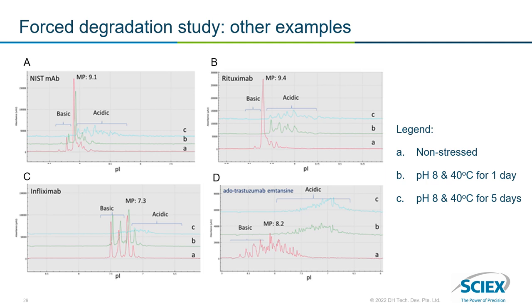These data demonstrate how this method can be applied as a platform method for a wide variety of therapeutic protein species and can help you make informed decisions about your product during developability assessments.